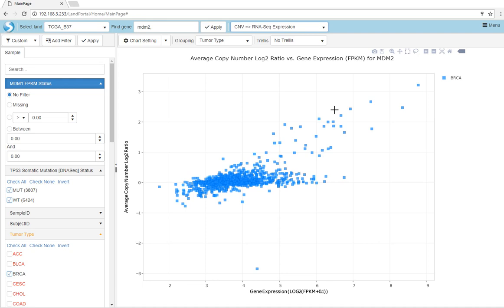While we have designed these charts to be optimally displayed, users have the ability to adjust multiple settings within the chart, such as chart height, colors, axis titles, and legend settings. LandPortal connects to a full Array Server, and the underlying data can be explored and analyzed in greater depth.